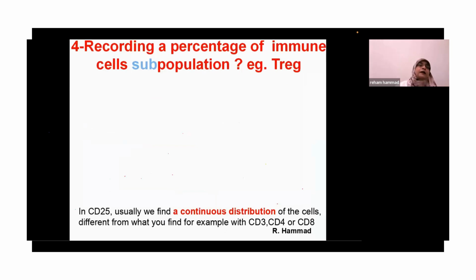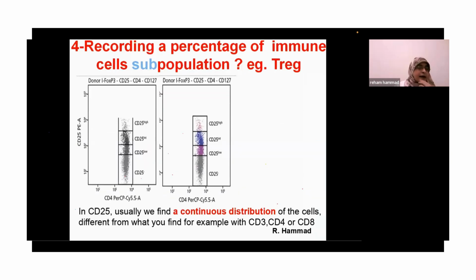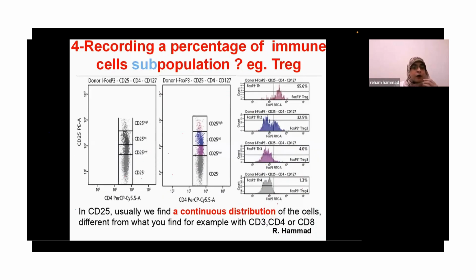Sometimes you need to use the flow cytometry to address the immune cells which are found in the microenvironment. In order to know those types of cells, you will have to identify the specific marker of each cell, especially one of the most important cells in immune therapy now, the T cell and the T regulatory. When you are looking for the T regulatory, you have to identify it by its characteristics. Don't just look for cells positive for FOXP3, CD25, and CD4. Actually, you are looking for high CD25 expressing CD4. As you can see in here, only the high CD25 cells express the transcriptional factor of the T regulatory, FOXP3, at the highest intensity of them all, while the intermediate, the low, and the negative are not.